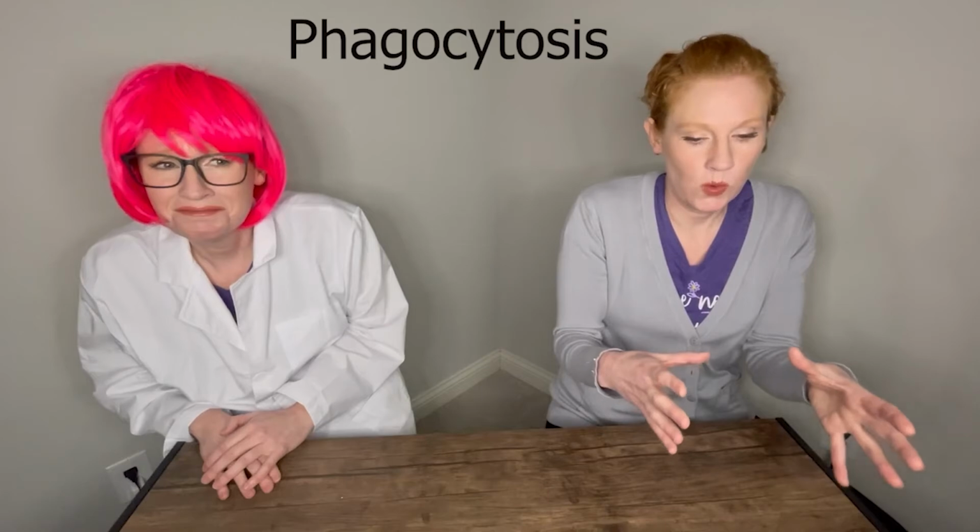The next thing that we're going to look at under the microscope are amoebas. And amoebas are pretty cool. They don't have a definite shape to them. They can move and warp. They've got what's called pseudopods, which they just extend like that's part of their body. And then they go after bacteria and algae. What they do is called phagocytosis, where they take things in and engulf them, swallow them and dissolve them inside of their body. It's kind of neat, actually.